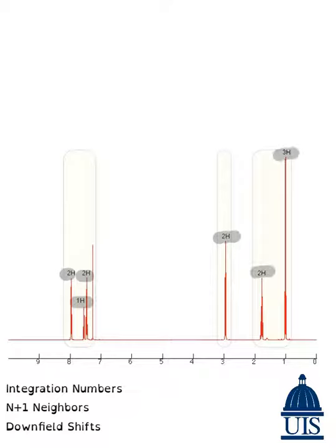And this signifies how many hydrogens we have in a specific environment, like how it's being downshifted by electronegative atoms, or where it's sitting in the molecule. And our integration numbers actually add up to our total number of hydrogens in the molecule. So as we can see, we have 2, 1, 2, that's 5, 2, 7, 2, 9, and then plus 3 is 12.